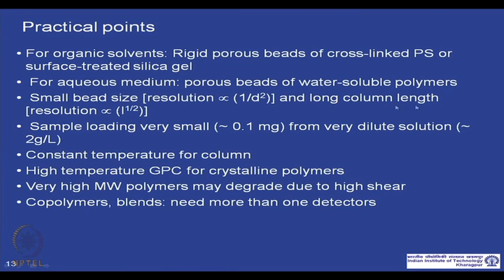The resolution also depends on the length of the column, but not as much as the diameter of the beads. It depends on length L to the power 1 half. So, if you increase the length of the column, the resolution goes up. So, preferably we use a longer column.